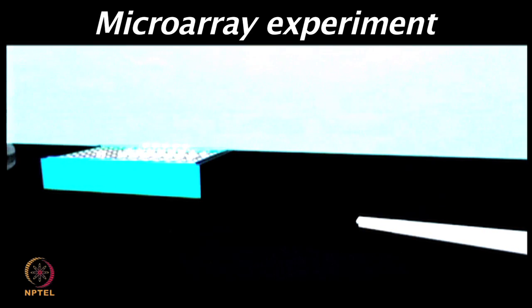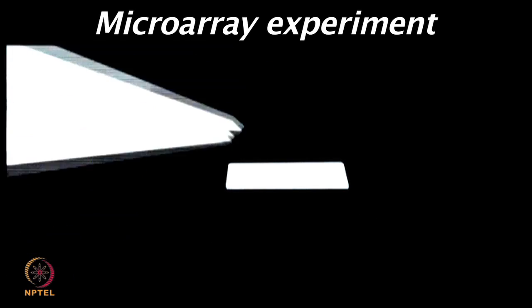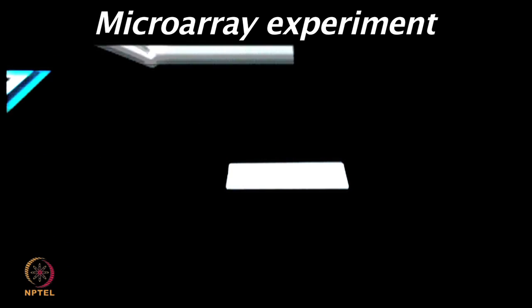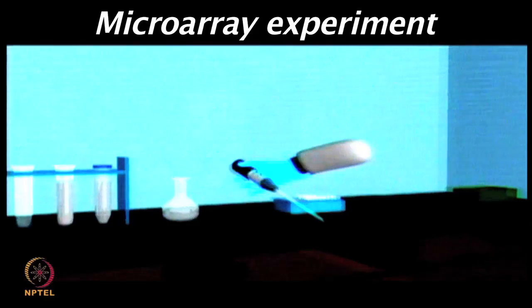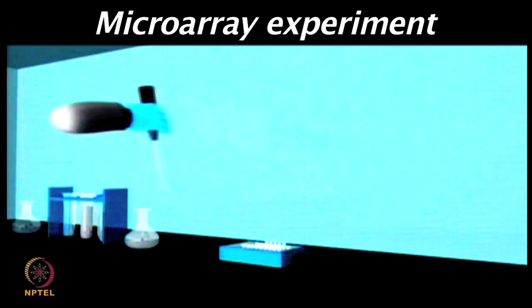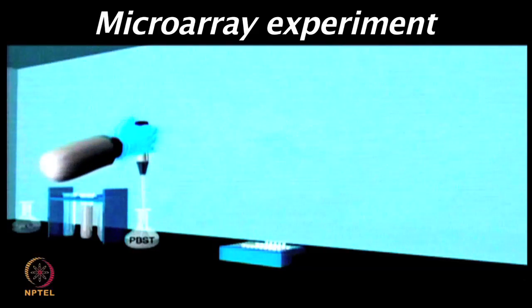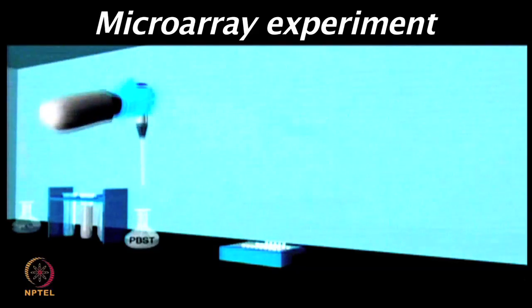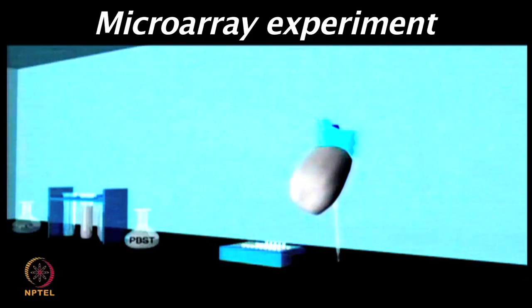But different investigators use different strategies for identifying the signals. For example, your secondary antibody could be conjugated with HRP based systems. If that is the case, then one can even use a tyramide signal amplification system. So, TSA reagent is a tyramide molecule which is linked to a label.